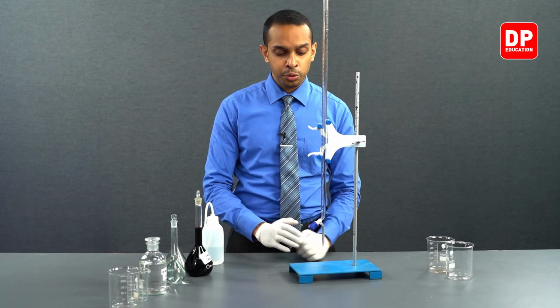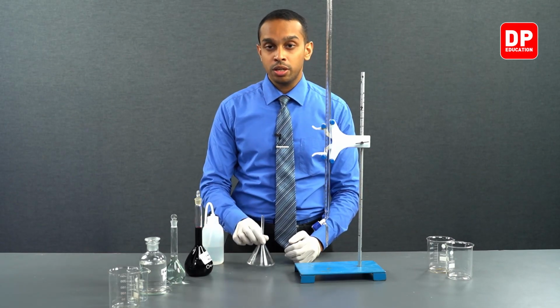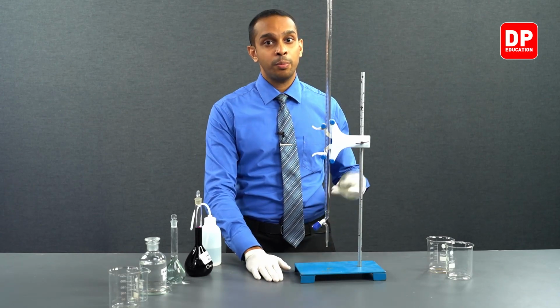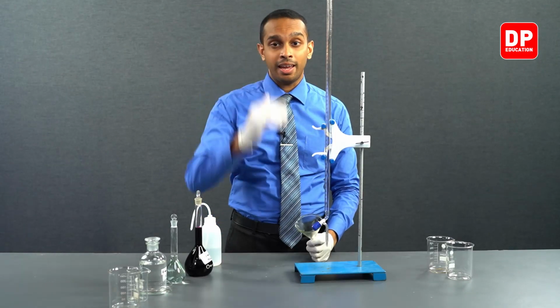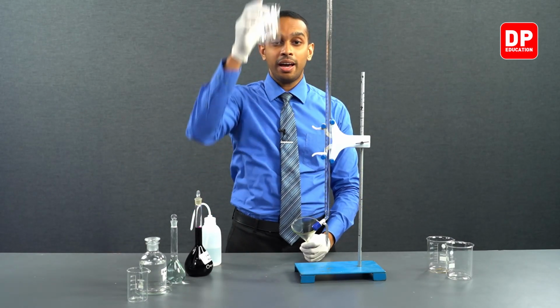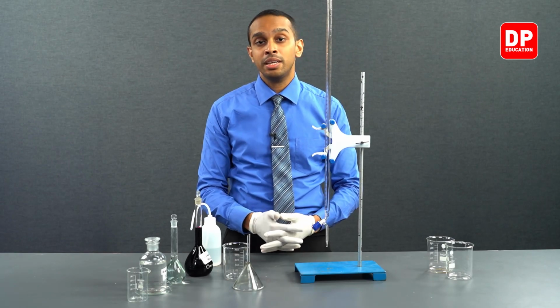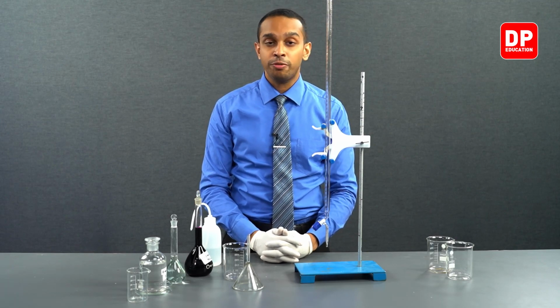Whenever you are trying to use a burette in a lab environment, one of the mistakes that I have seen a lot of students make is that they keep the burette and the retort stand on the lab desk itself, and then place a funnel on the burette, which is over their head, and lift the solution over their heads. This is a risk, because if you spill it while it's over your head, it will directly spill on your face. So we will not do that whenever we are filling a burette.